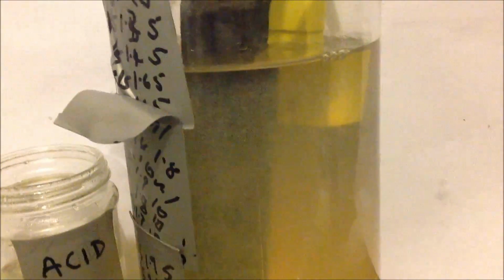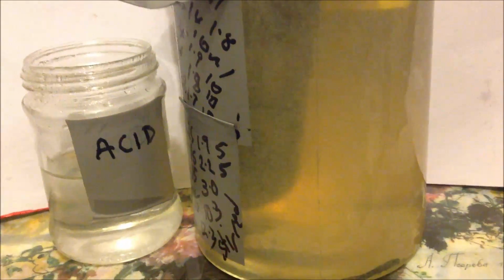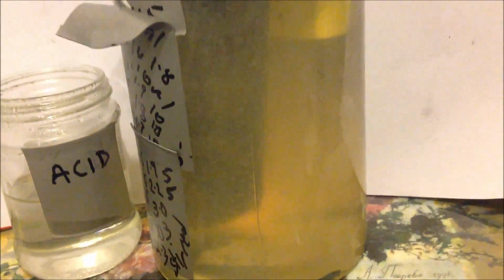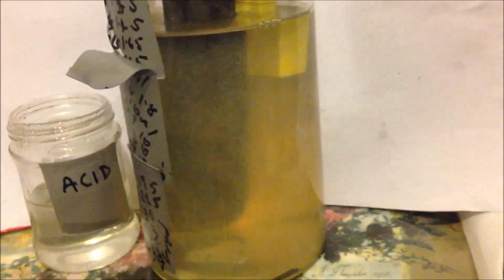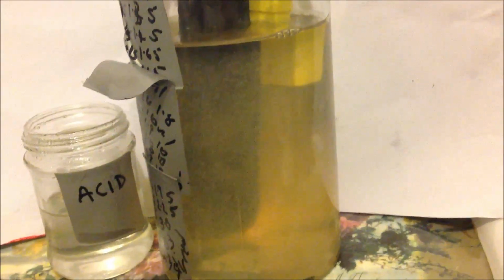So I'll just leave that there now. And I'll just monitor the pH, make sure it stays around 8.5 to 9, and I will bring it up to 10.7 as well. I'll just let it stabilise like this, I think, for maybe even overnight.